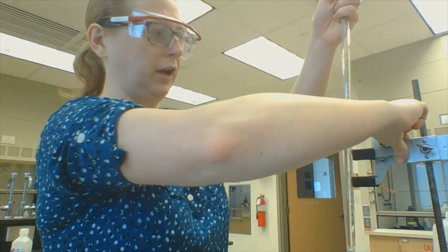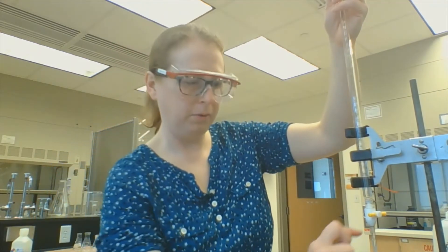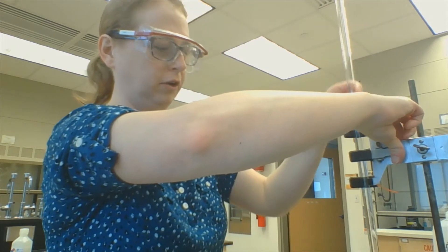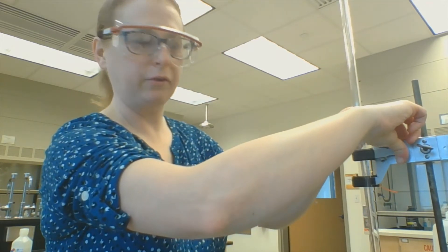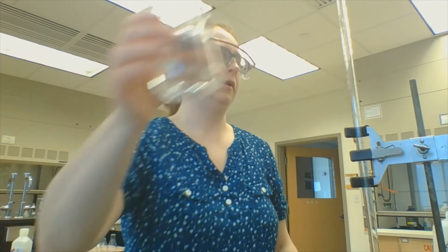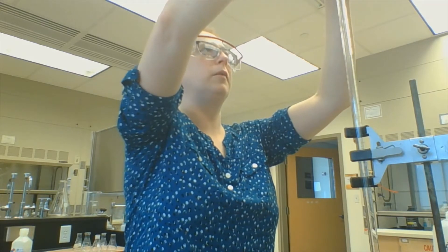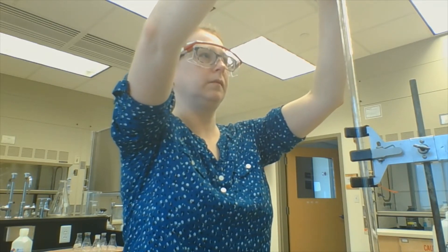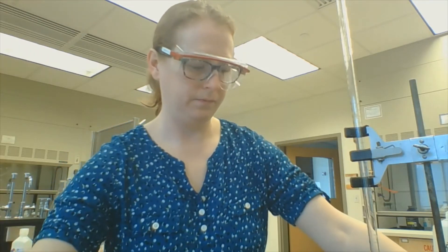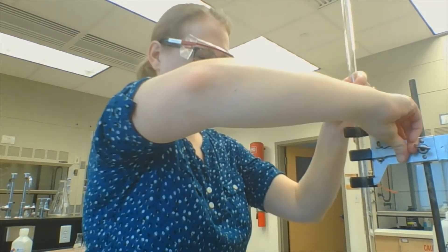Now I want to clean out the stopcock of the burette. Remember that liquid will flow through this little part, and you want to make sure that liquid is sodium hydroxide instead of dregs from the last person who used it. So I pour a small rinse portion in here, being smart and using my funnel so I don't make mistakes, and then drain all of that through the stopcock.